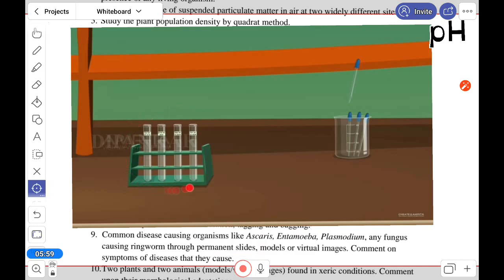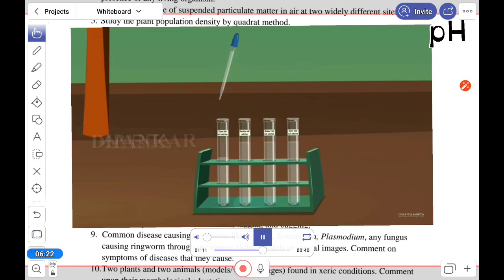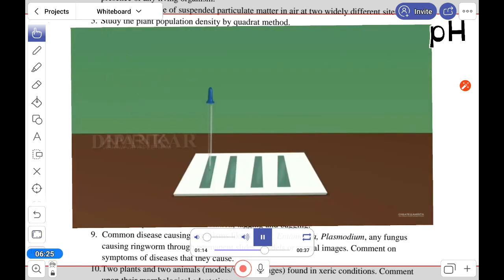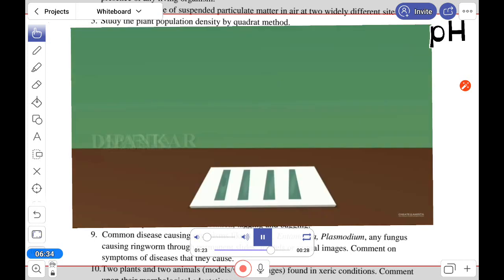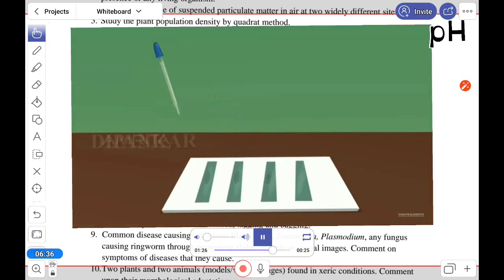When we find out the pH of pond water or other water bodies, water will be collected directly and the experiment will be the same as before. In case of water, we are using two different water bodies to find out the pH. When we test water, this practical will be a little bit shorter because we use water directly.